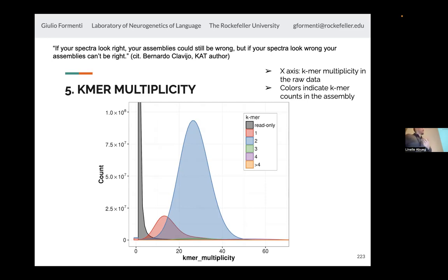So we compare the count of every k-mer in the assembly with the same k-mer count in the reads. So remember now, the shape of the previous is like, yeah, there is a descending line like this, and then it goes up, and then it goes down, right? This is not necessarily the same individual, so the heterozygosity could be different. But now we're coloring it.